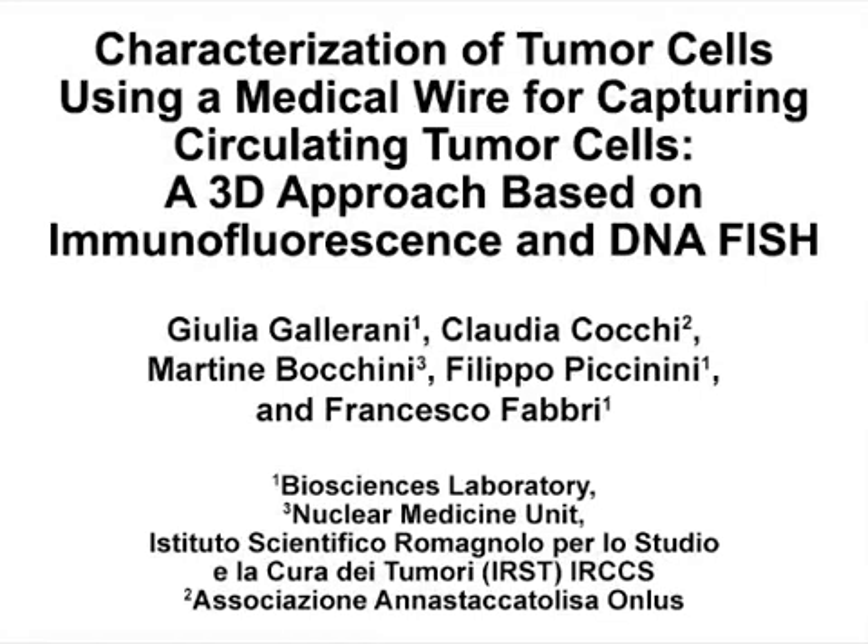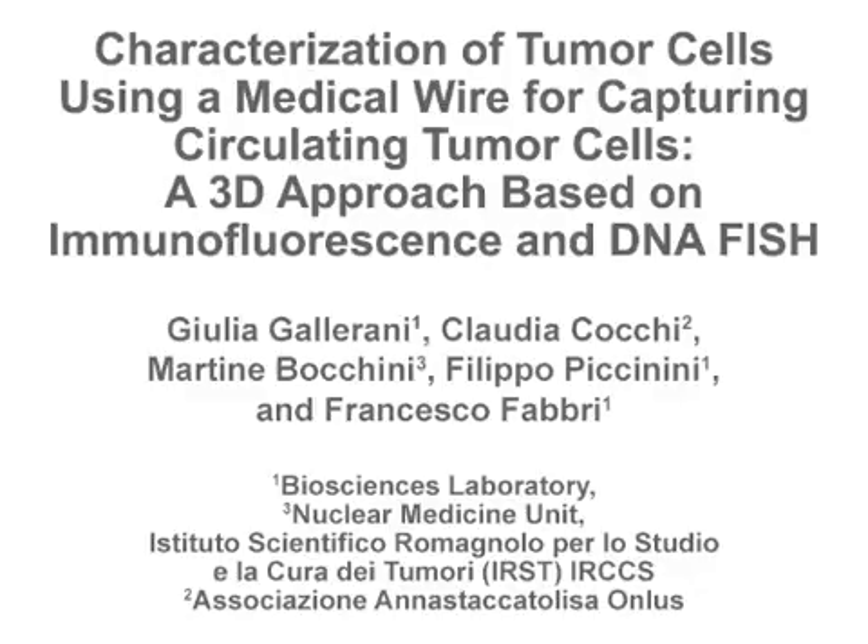The overall goal of this protocol is to combine immunofluorescent staining with DNA fluorescent in-situ hybridization on a 3D functionalized wire, and to identify immunophenotype and FISH signals on this support using a conventional wide-field fluorescence microscope.